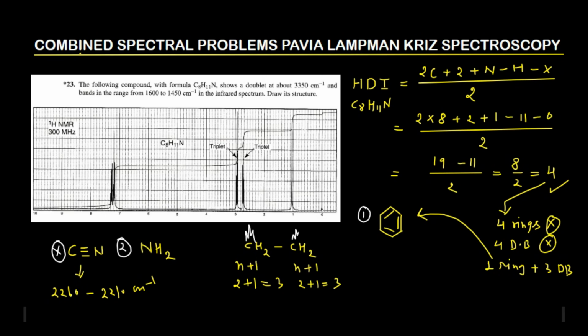Okay, so second fragment is this one. This is fragment number 3. So in short, you are having these three fragments. And if you count the total number of carbon atoms, 6, 7, 8. So this is C8, 11 of your hydrogen. 1, 2, 3, 4, 5, 6, 7, 8, 9, 10, 11. Because this will be mono substituted, you will have only 5 hydrogens on the benzene ring, right? And so you are having these three things. And now you can conclude your structure, what actually we are having. So if I put the pieces together, I'll have this thing.